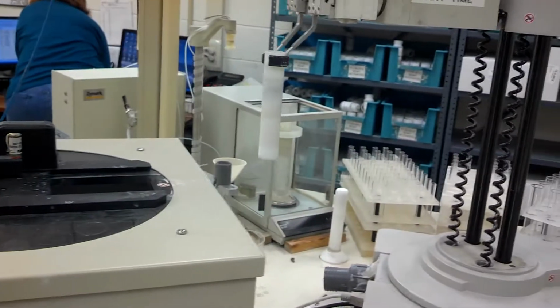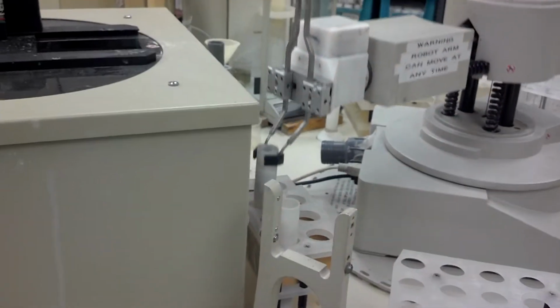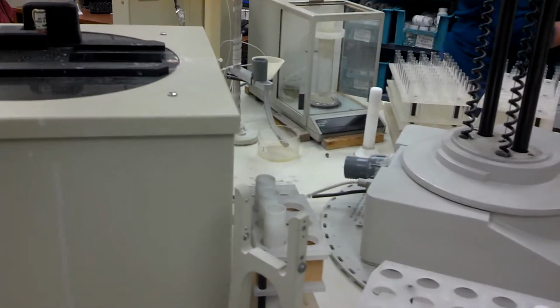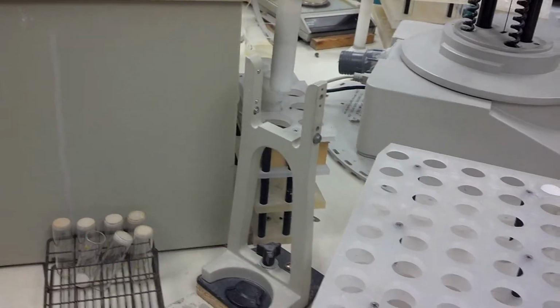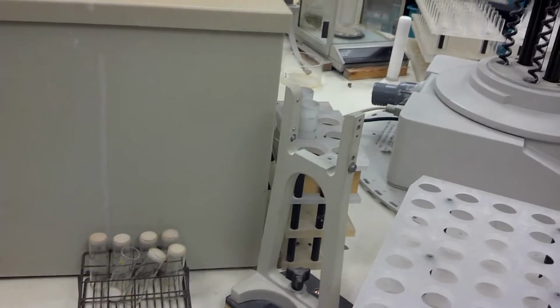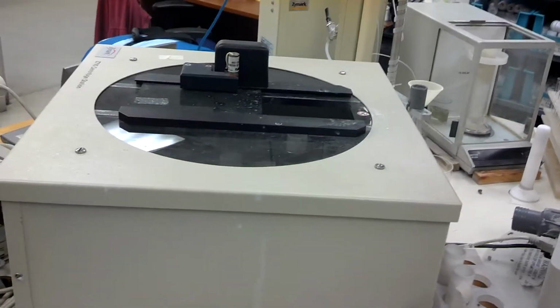Yep. Could you put that in a vacuum nest? Would that do the same? Say that again? A vacuum nest. Suppose that instead of centrifuging it, we put those things into a vacuum, close the vacuum, and pull a vacuum on it. That'll pull all the water out. You set the vacuum level and the length of time that you want it to pull. That's actually probably a great idea. I would think it would probably have to be calibrated to what we have now.